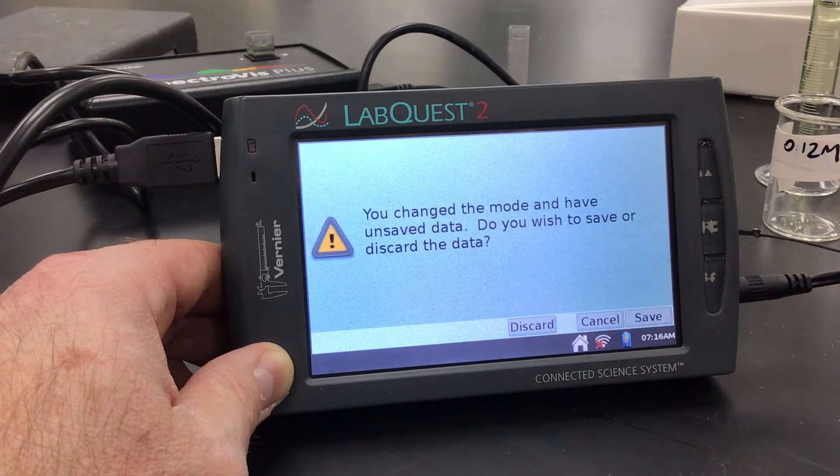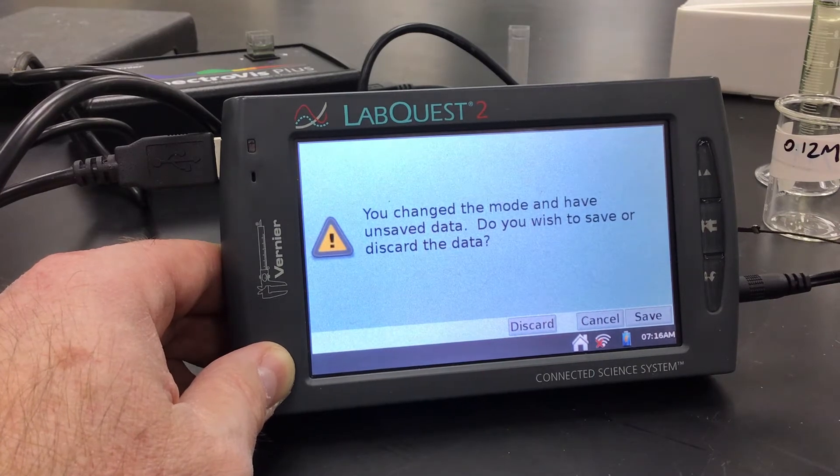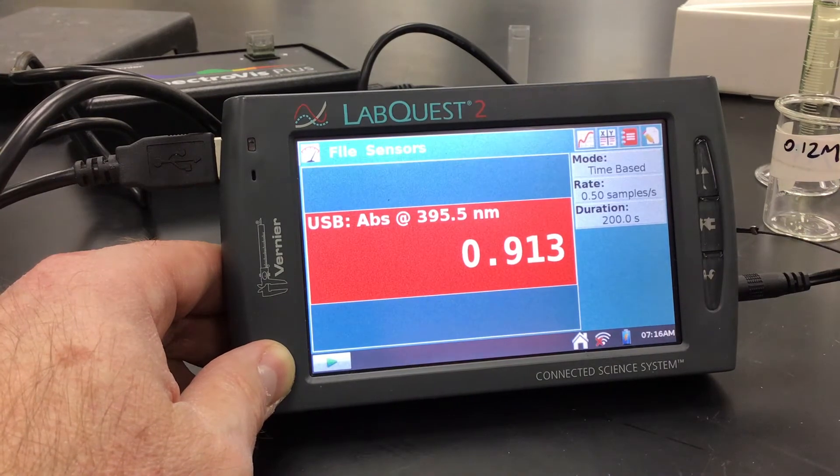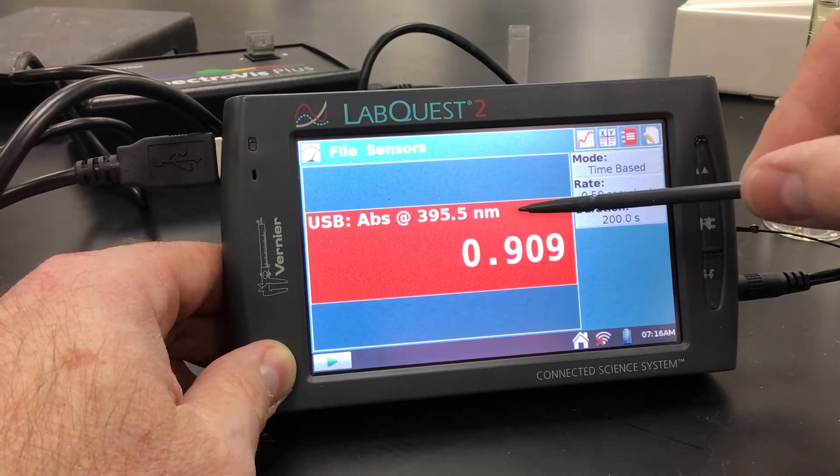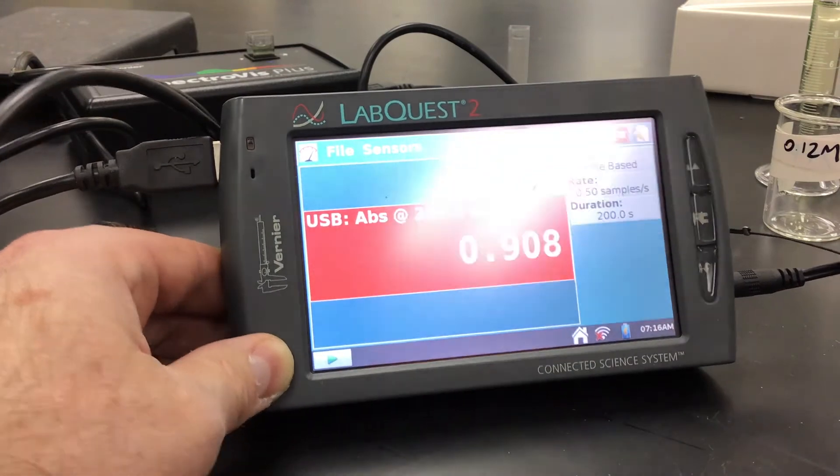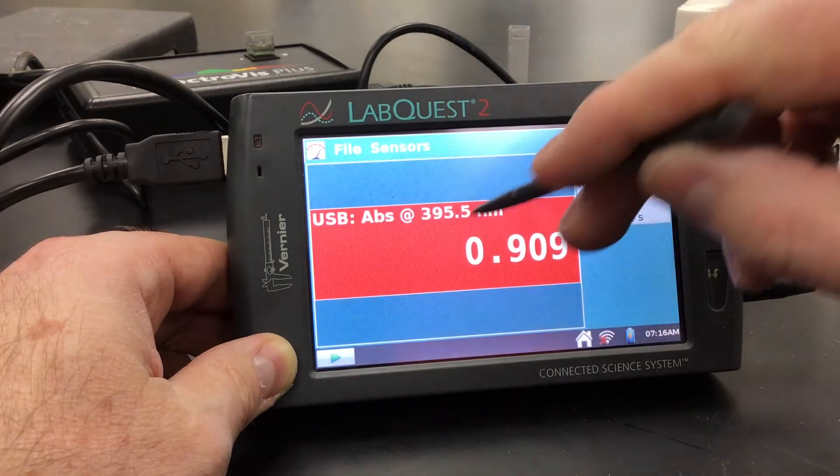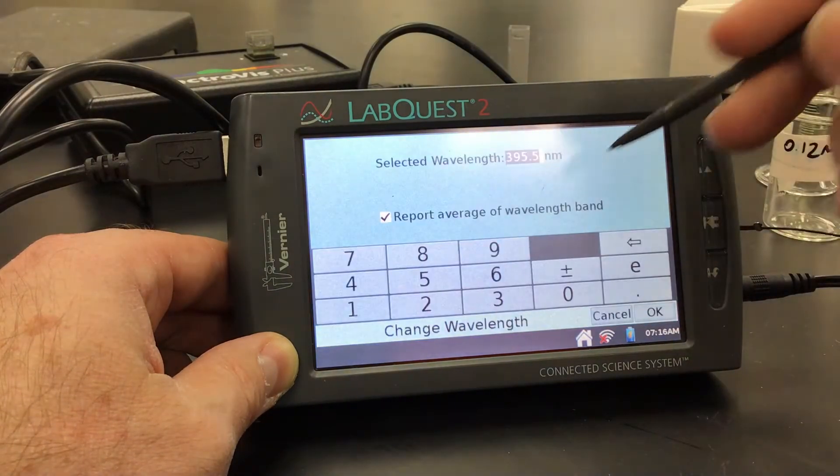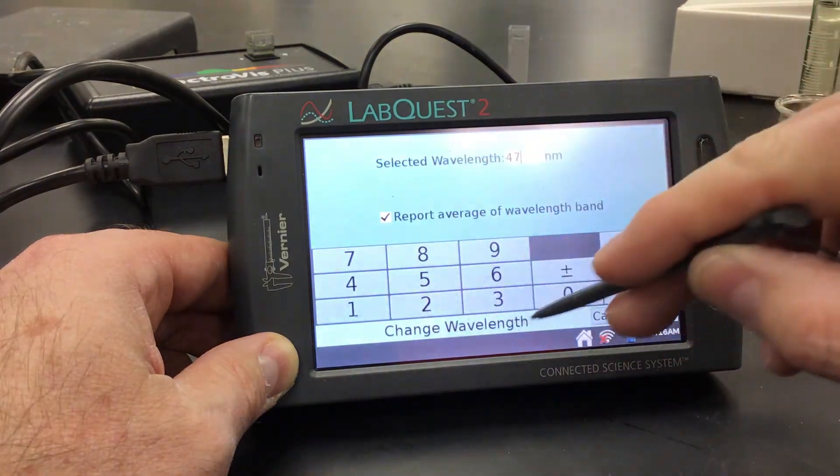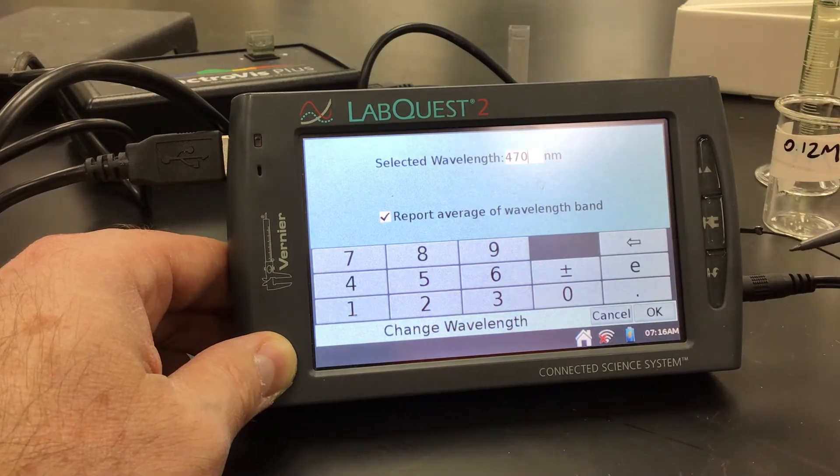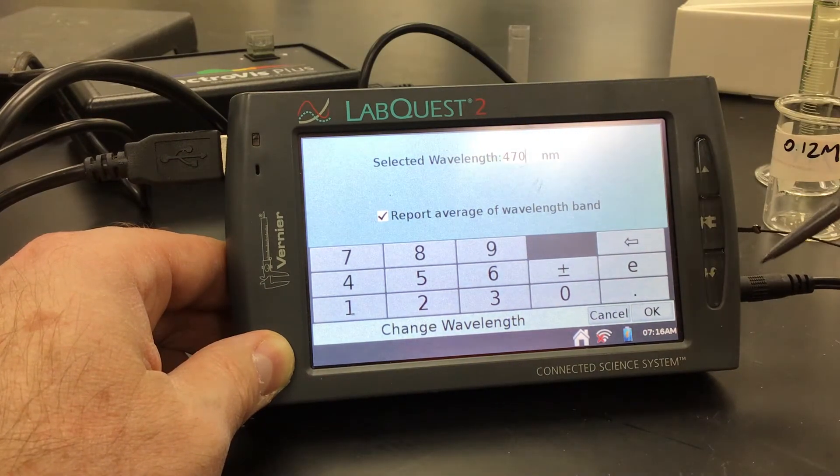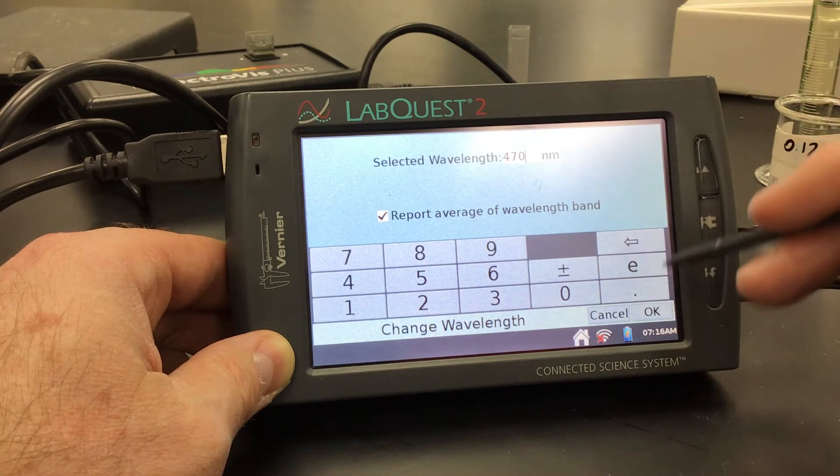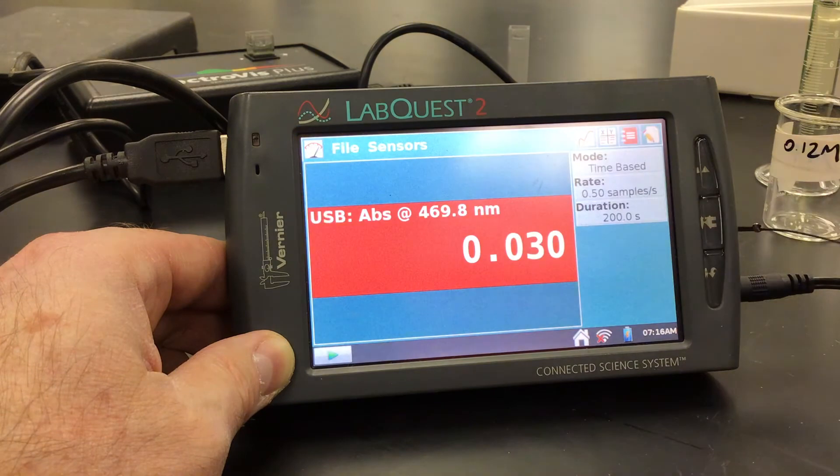Normally, I would maybe save this. You can save it at any point. I'm just going to discard this data here. And notice that it's not saving the wavelength, which is a real pain in the butt, but there's a way around this. So we can tap in the red, and then we can go to change wavelength, and then we can change the wavelength to 470 like we want. So for some reason, sometimes whether I save the file or not, it sort of defaults that, and it doesn't save it when it should.